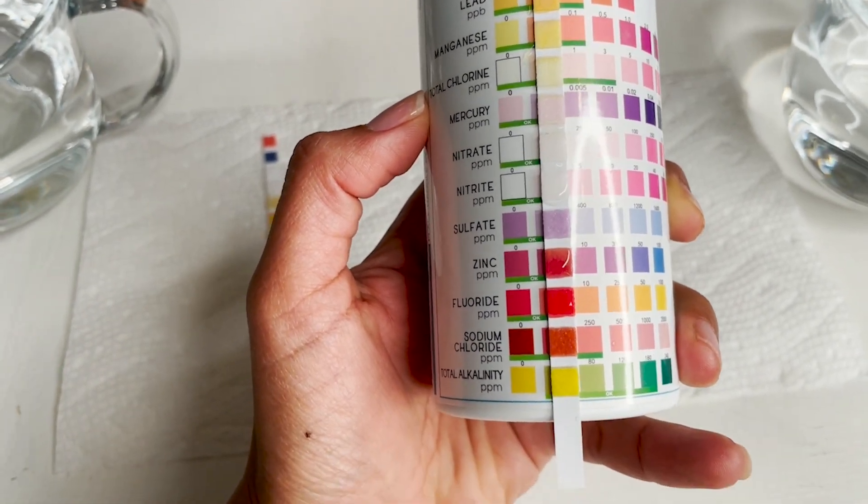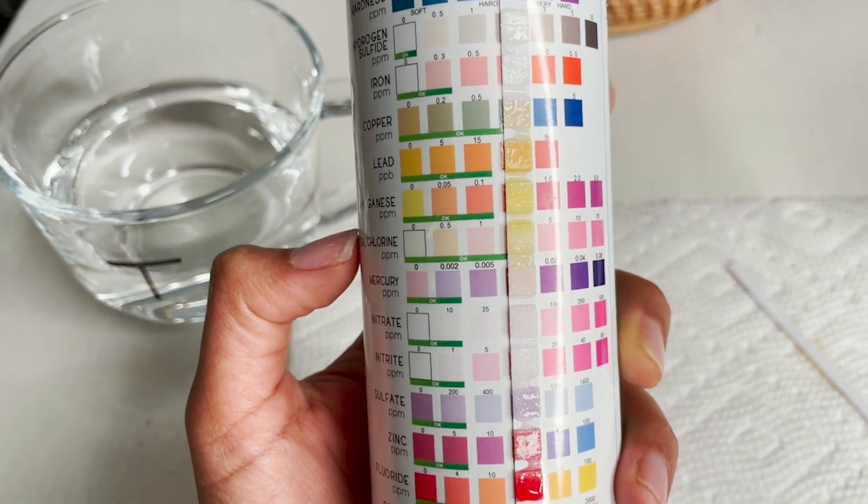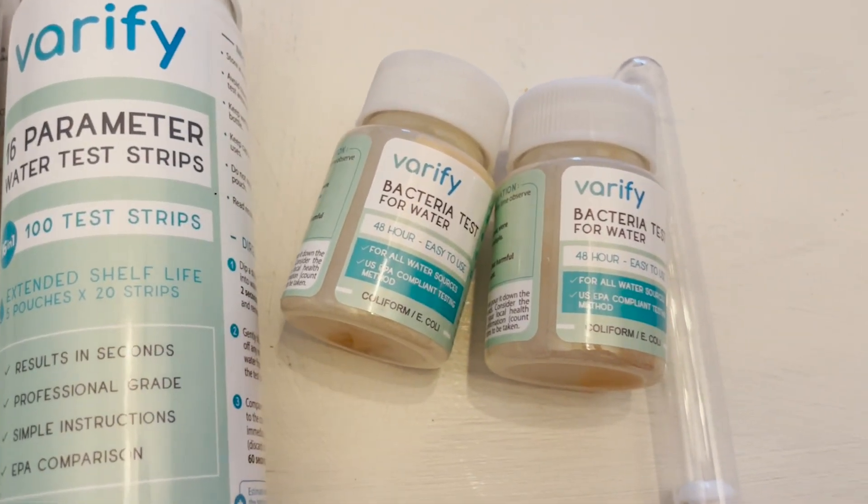Something very practical about this kit is that it has a hundred strips for water testing, so you can always share these strips with your family or your friends. With this testing kit, you get the results in seconds and it's very simple to use. I highly recommend this — it's very affordable, and that is my point of view.